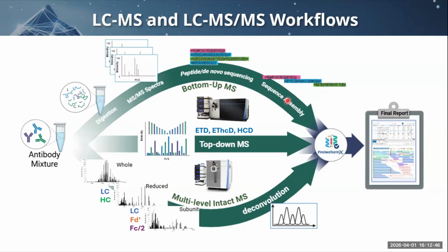our intact molecule. At the intact level, we do this at 3 levels: whole, reduced, and subunits. The whole could be, we do both with glycan and then deglycosylated. Any data presented are deglycosylated. The glycans were removed with PNGase F.